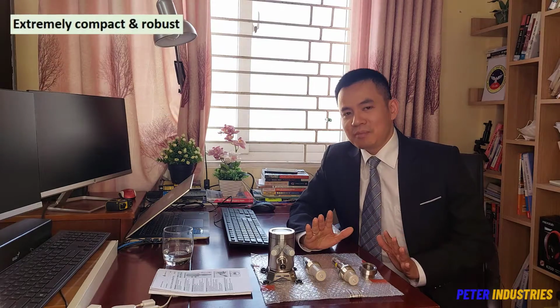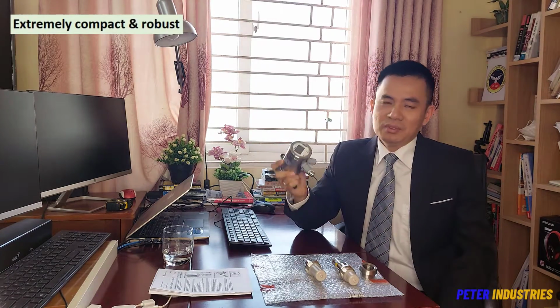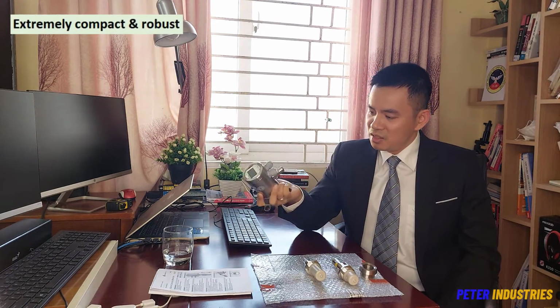So, what makes the Anderson Negele conductivity sensor so special? 4 things. Number 1, it meets all the food and beverage and pharmaceutical standards. And number 2, hygienic by design, very robust and also reliable, flexible design.